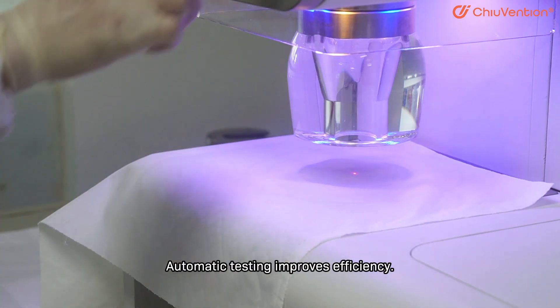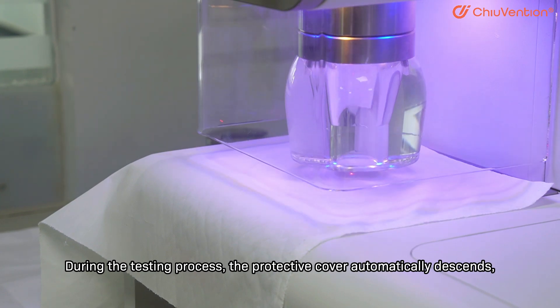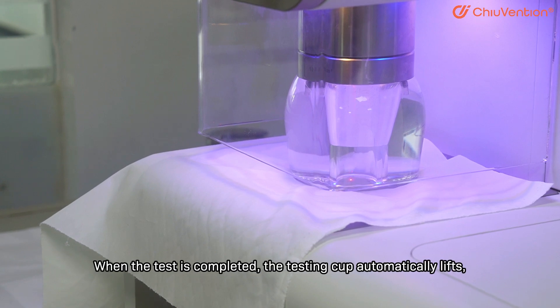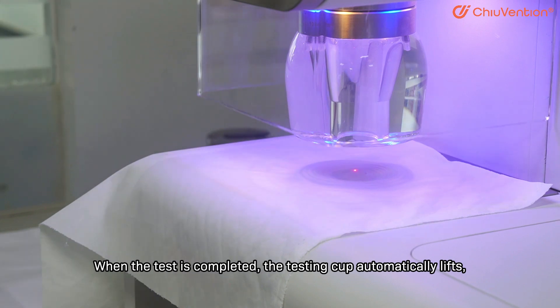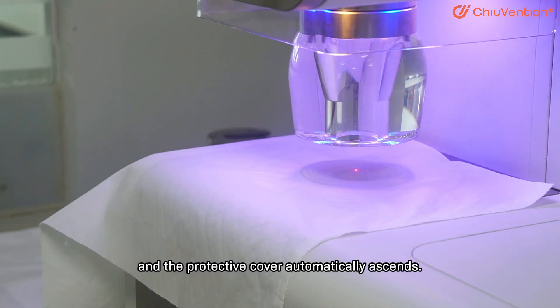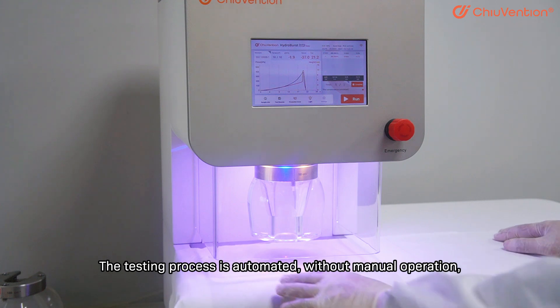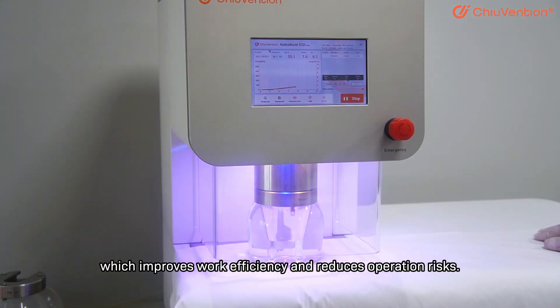Automatic testing improves efficiency. During the testing process, the protective cover automatically descends, and then the testing cup is pressed for testing. When the test is completed, the testing cup automatically lifts and the protective cover automatically ascends. The testing process is automated without manual operation, which improves work efficiency and reduces operation risks.